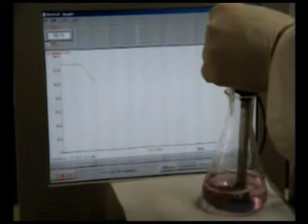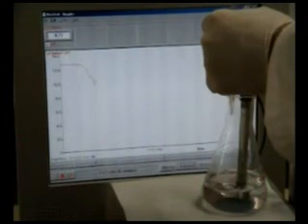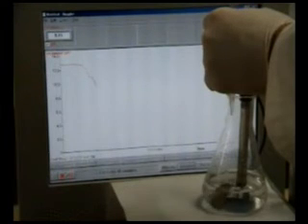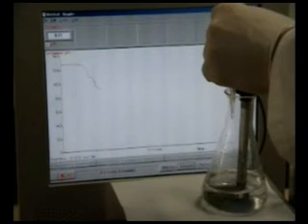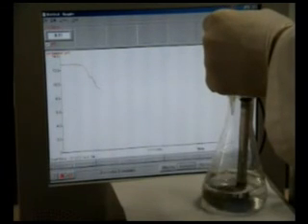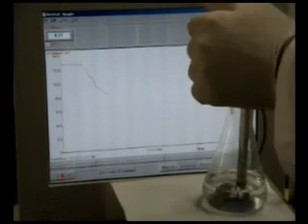The shape of the curve is not important this time, the burette is controlled to aim for the equivalence point of pH 8.4 that was determined from the previous graph. When this pH is reached, the final burette reading is recorded to calculate the concentration of the vinegar solution.